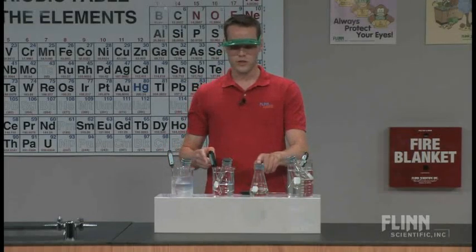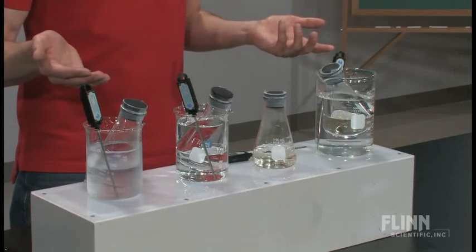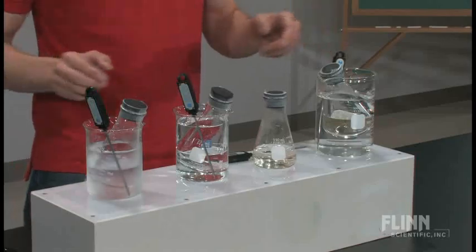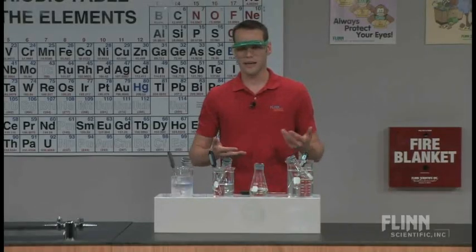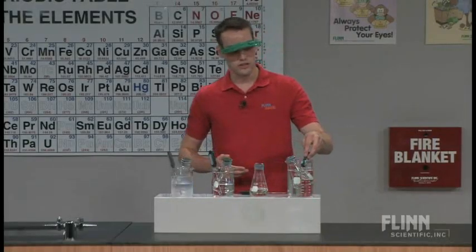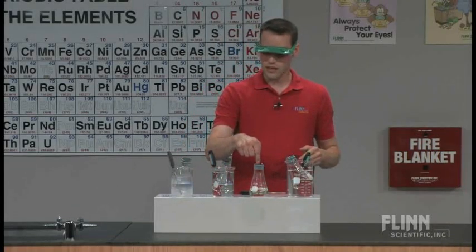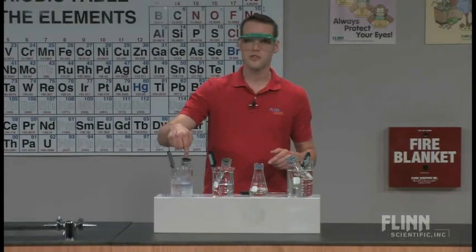One of them's at room temperature. I do one with cool water. Usually I just take the cold tap water out of my sink. I have this one on an ice water bath, and then this one is a warm water bath. Don't get this too hot. You can decompose the compounds very quickly and cause an unwanted side reaction. So this one's at about 37 Celsius. This is at 25 Celsius, this is at 15 Celsius, and this is at about 2 Celsius.